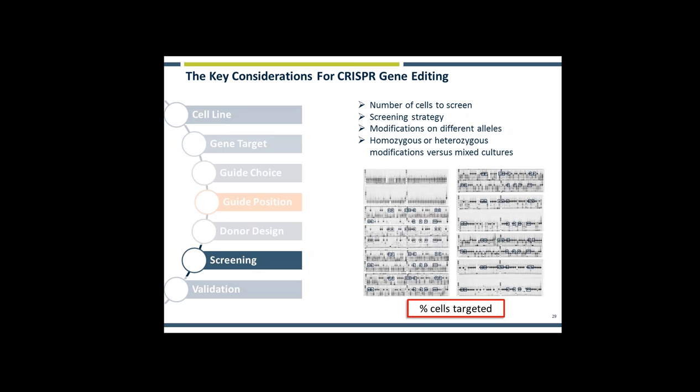And it is, I should just say, a way of screening for clones that have undergone disruption, but as I'll discuss in a minute, we then need to validate what that is. Now, what I would say is PCR works for us, and we're set up to do a lot of PCR here, but most labs aren't, or at least most labs will already have in their hands optimized assays that may be more appropriate for their screening protocols.